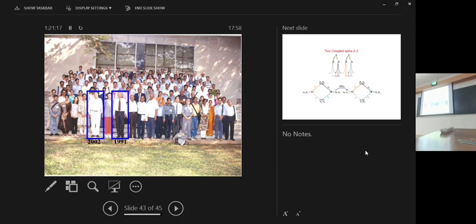One-bond couplings vary depending upon the system. Proton-proton one-bond coupling is very large, but of course you don't see that mostly. You see carbon-13 proton coupling and nitrogen proton coupling. Nitrogen proton coupling is of the order of 90 to 100 hertz. Proton to carbon coupling is about 140 to 160 hertz. Those are dependent on the electron density there.